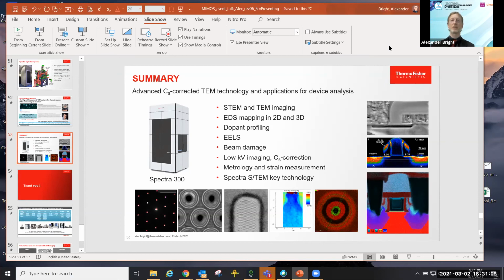But once you have a microscope, you can't change that. And I do recommend you optimize the acceleration voltage to try and find the voltage at which the damage is lowest, but you get the highest count rate. That's going to be different for every material. So it's really worth trying to find out what acceleration voltage gives you the best results on your type of samples and application.